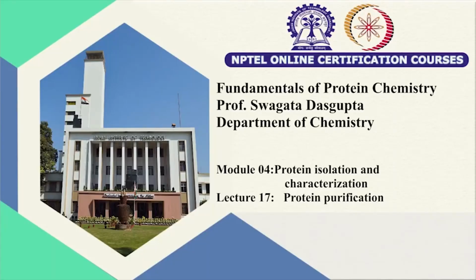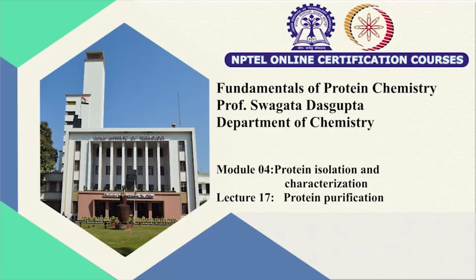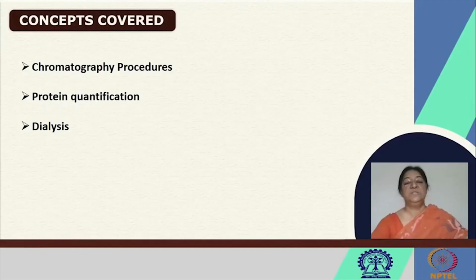Second lecture of Module 4, which deals with protein isolation and characterization. We will be looking at protein purification protocols. In the previous lecture, we looked at salting out, centrifugation, and some idea about sedimentation techniques. In this lecture, we will be looking at specific aspects of chromatography procedures, protein quantification, and finally dialysis.